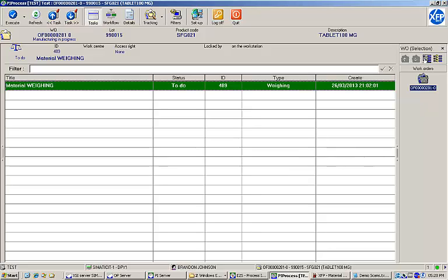The next task in our EBR execution is to weigh all of the required items on our work order's bill of materials. Weighing is one of the core MES functions, and there is a standard module to handle it. In this video, I will continue the execution of our EBR and demonstrate the weighing functionality.